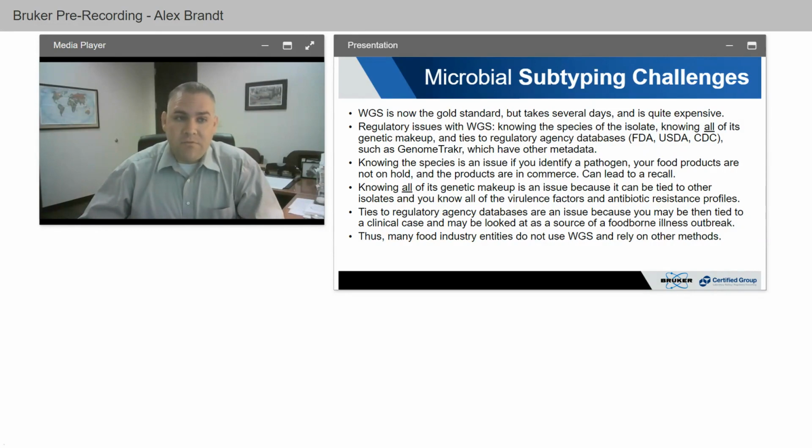Well, one thing that's really a big con to a lot of people using it is that you will end up knowing the species of the isolate and knowing all of its genetic makeup. So that then allows it to be tied to regulatory agency databases such as FDA, USDA, and CDC that utilize databases such as Genome Tracker. And that has other metadata. So if that is out there, then you could potentially be linked to a foodborne illness outbreak.